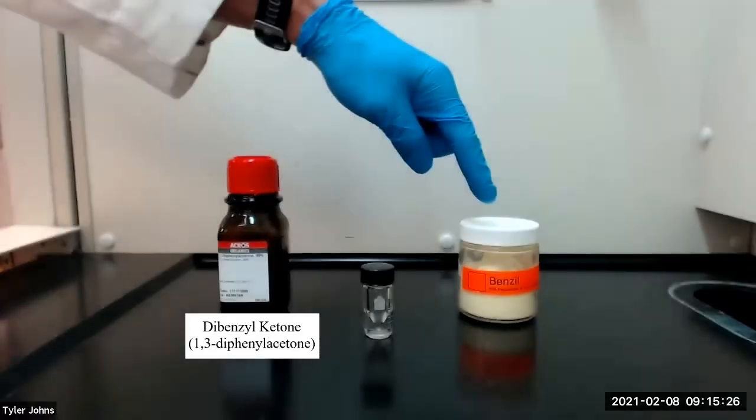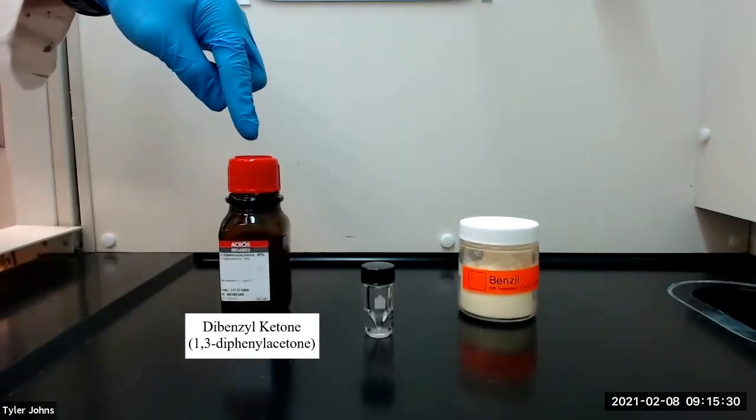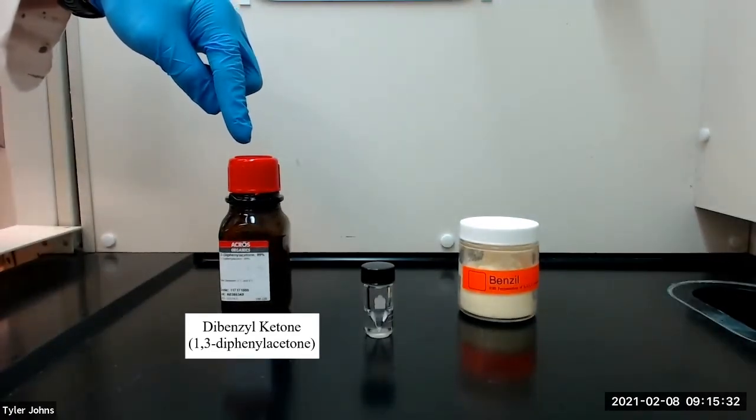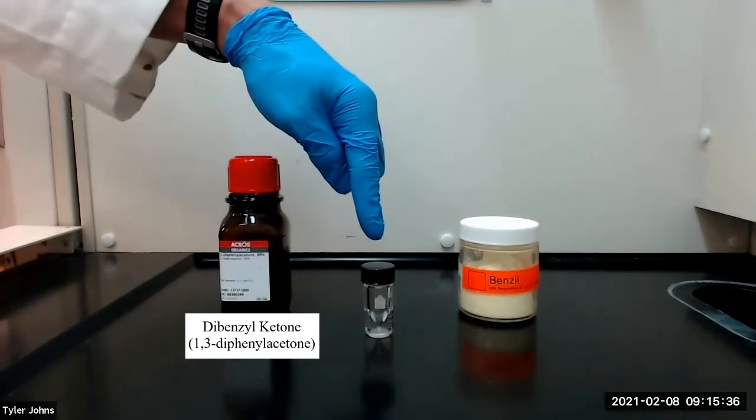To begin, we will add 0.1 grams of benzil and 0.1 grams of dibenzyl ketone, or 1,3-diphenylacetone, to a 3-milliliter conical vial.